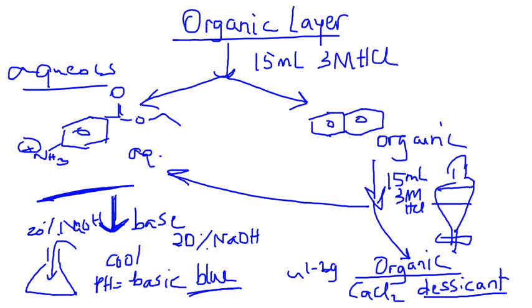You really need to get a feel for this. As you add the desiccant, you will see that when you swirl, some of the solid will remain stuck at the bottom because it will become heavy as it absorbs the moisture, and some probably would move with the swirling action.